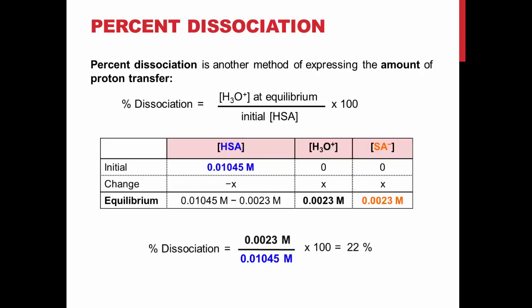Before you begin your titration, fill a 400 mL beaker with hot tap water and place it on a hot plate set at 1.